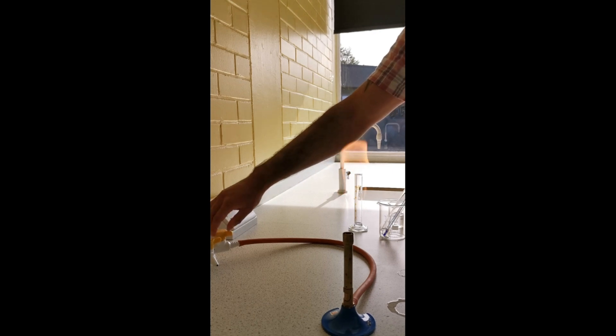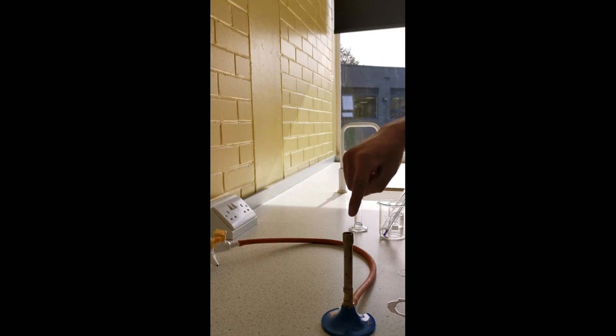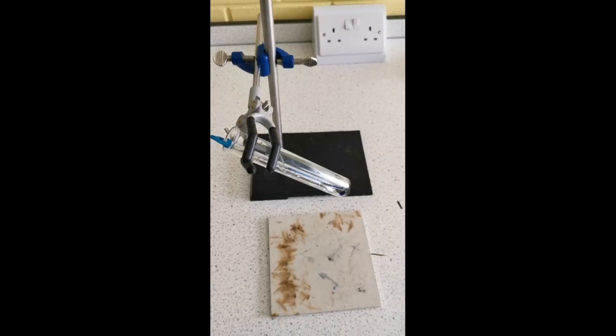When you turn your Bunsen burner off, once again make sure your face is not above it. This right now is going to be extremely hot. It's metal, remember, so I'm not going to grab this. I'm going to wait for it to cool down before I put it away.